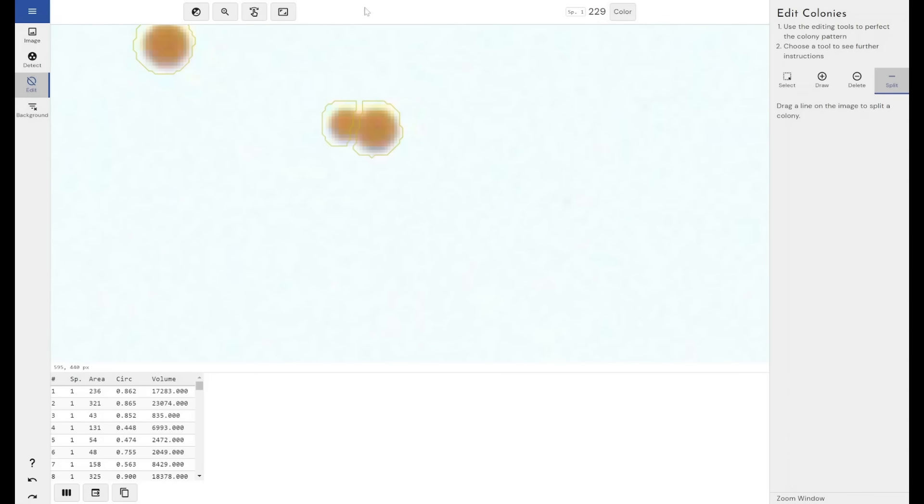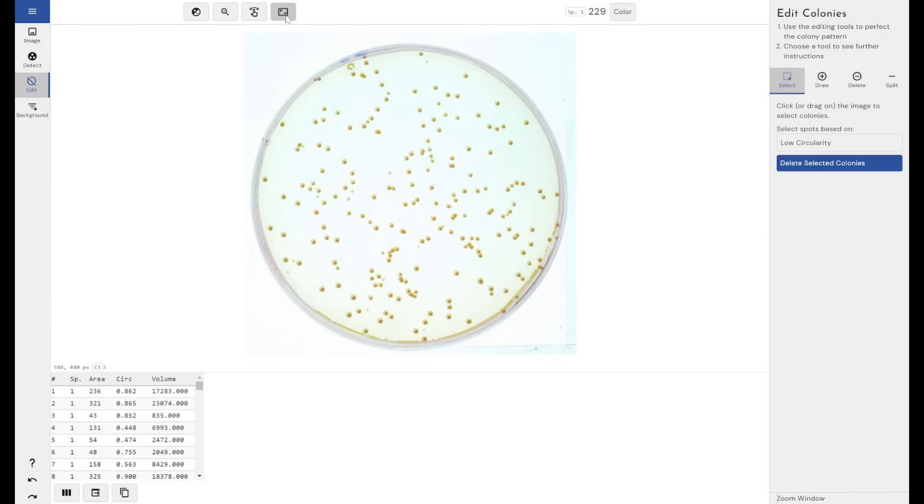You do have that manual intervention if necessary. But if you can automatically detect 90% of your colonies and you need to manually adjust just 10%, you're still saving a huge amount of time, especially if you were doing this manually anyway.